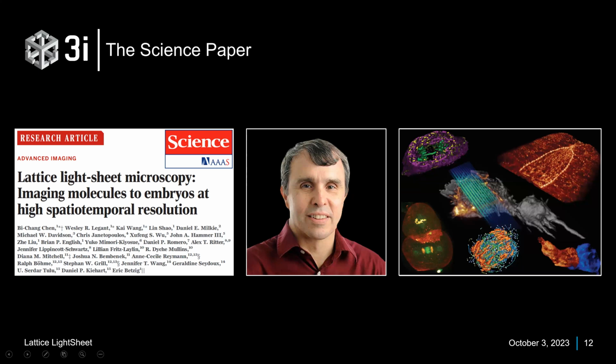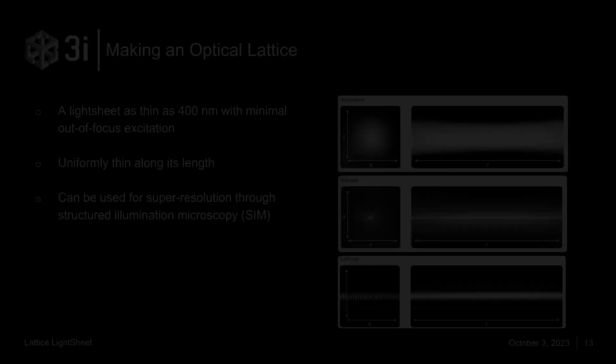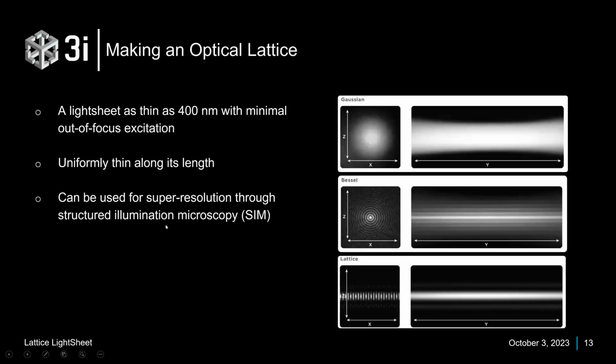And what I wish more lattice researchers would do, there is a wonderful supplemental table that explains his imaging parameters for every sample he did. So if you want to image, I don't know, mitochondria in a U2OS cell, there is probably a reference to that somewhere in the paper. And it's really great as you learn how the lattice works to start with some of these imaging parameters that are in there, just because it is different than using a spinning disk. Not every researcher continues to do that, which makes me a little sad, but it'd be nice.